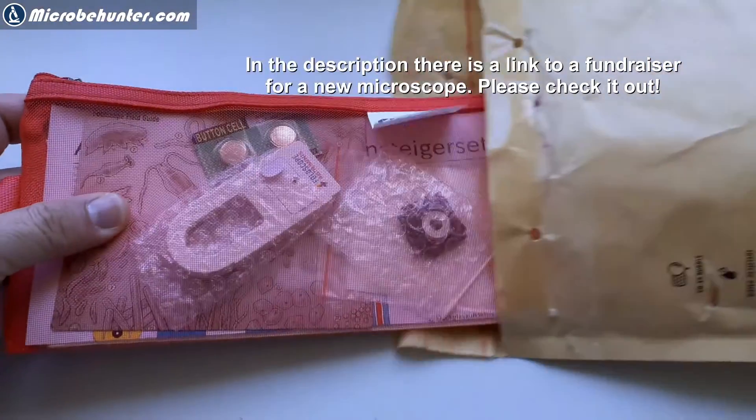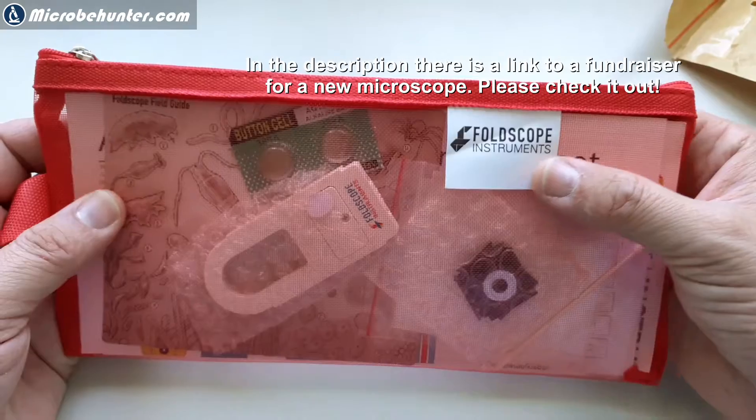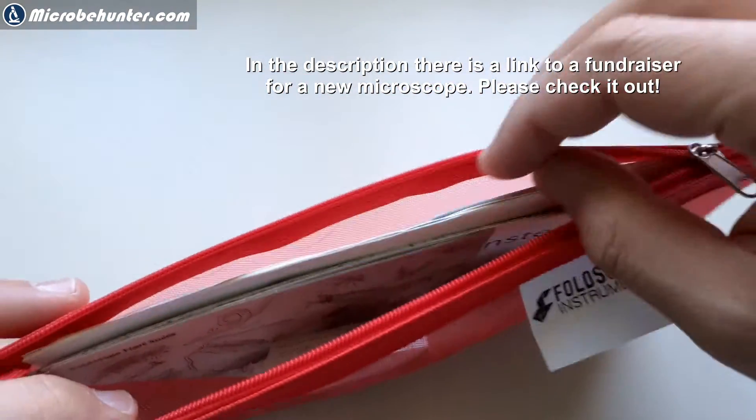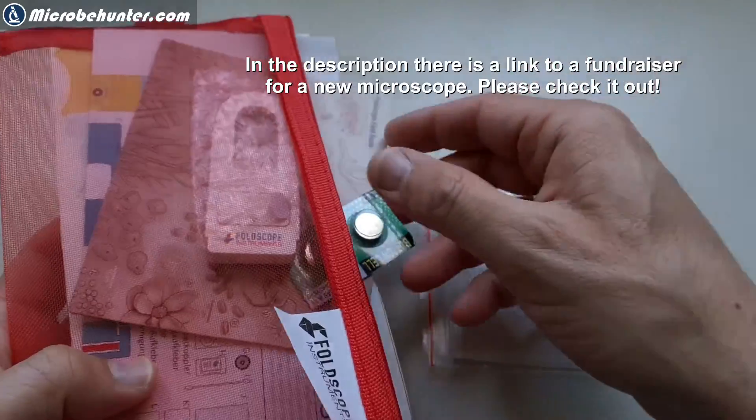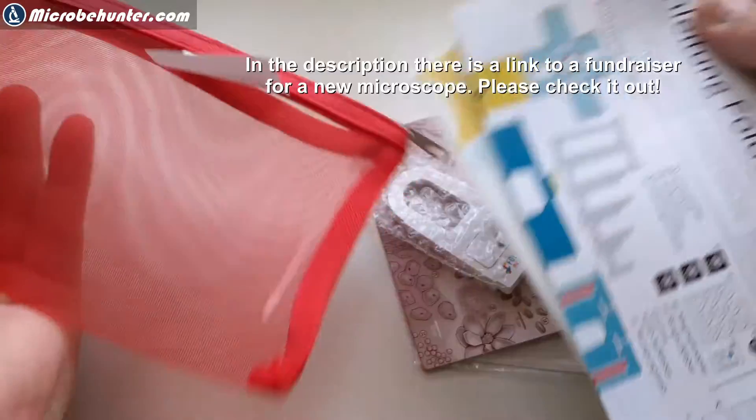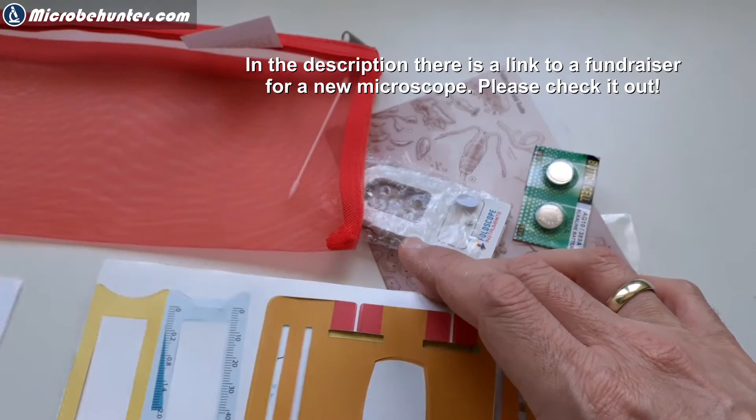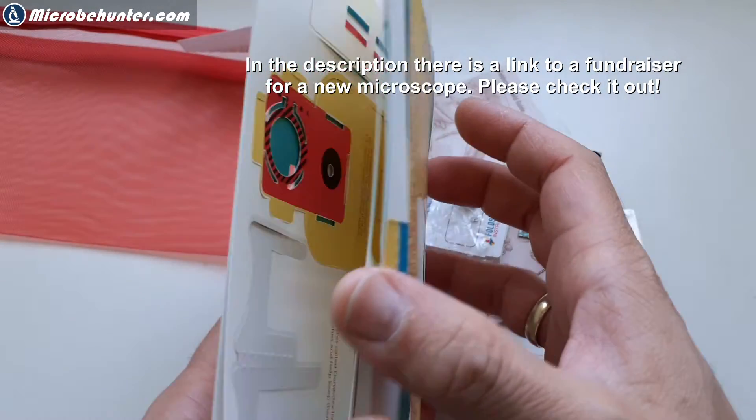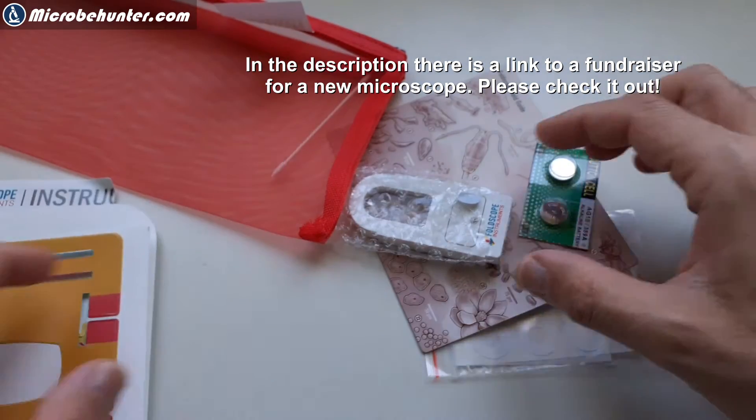Well, the Foldscope was actually intended or is intended to be an extremely low cost $1 microscope so that the microscopes can become accessible to the wider masses, so to say. Also, of course, to the general public. Surprisingly, it was not that cheap. I paid on eBay 5 euros for this Foldscope and then I had to pay an additional 5 euros for shipping costs. And this was by far the cheapest one I could find. But you do get a little bit for that money. I mean, the instructions were excellent. In this case, both in German and English because I bought it over a German shop.